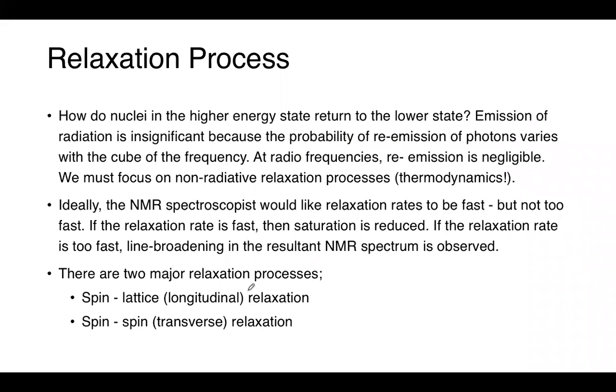So the relaxation process. How do nuclei in the higher energy state return to the lower state? Emission of radiation is insignificant because the probability of re-emission of photons varies with the cube of the frequency. At radio frequencies, re-emission is negligible. We must focus on non-radiative relaxation processes. So this is the thermodynamics.